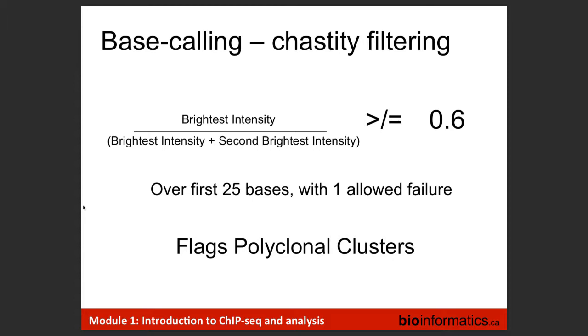The other component, which I'm not going to spend time on, but just very briefly, is the concept of phasing and pre-phasing. You can imagine if you've got 1,000 molecules where you're incorporating bases at every cycle, you're going to get some that don't incorporate. So you get out of phase, so these become phased. Or you get some that incorporate more than one base at every cycle, and they become pre-phased. As you extend out 100 bases, you get more and more of these that become out of phase. Then when you're shining the laser and trying to determine the signal at that particular position, it becomes a mixed signal, and eventually it becomes impossible to determine what the actual primary base is. So that's phasing and pre-phasing, and that's another characteristic of the platform.